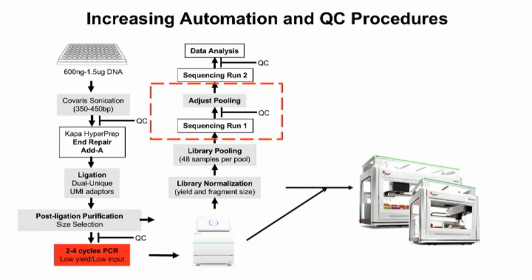You do have to do the validation runs on the pairings because there are certain pairs of indexes that all of a sudden will change behavior. So I think we've thrown out about 8 different pairs over the set of 192 and redesigned, because when we switched up the pairs, the performance changed. So it is something to keep in mind. The conclusion is switching up index pairs can have an effect on how well they're represented downstream.